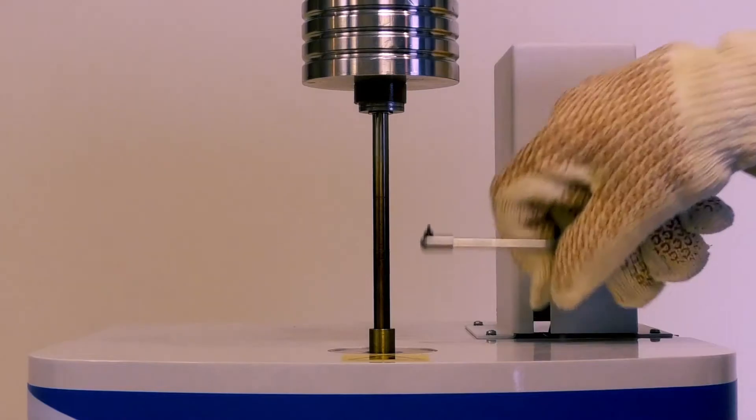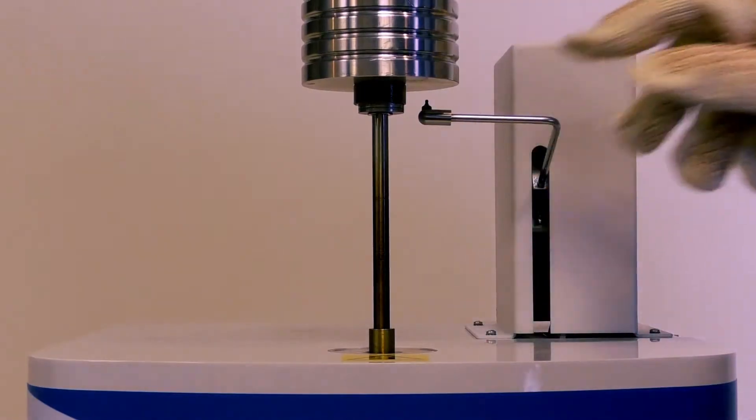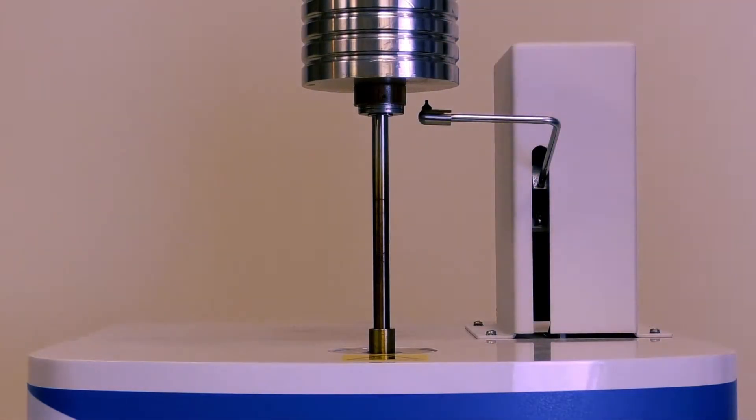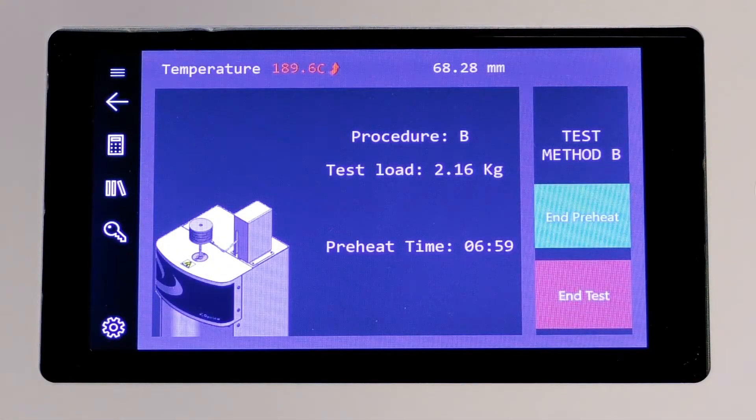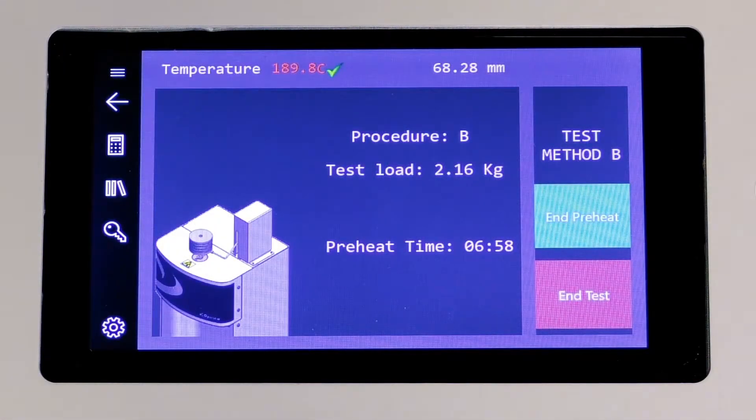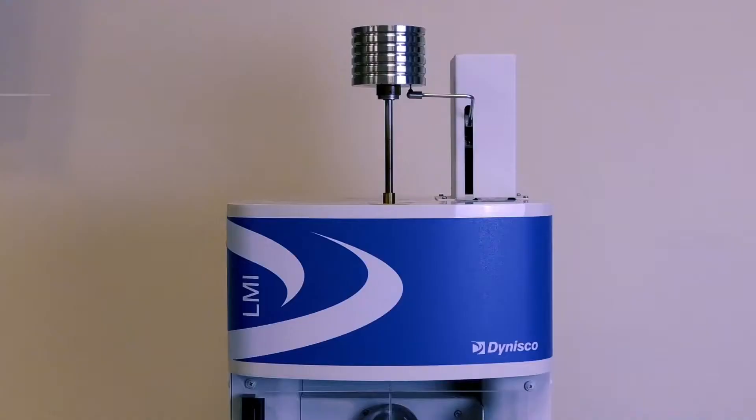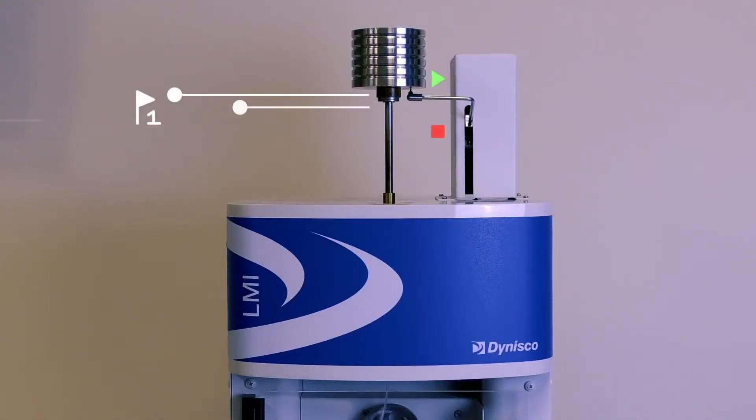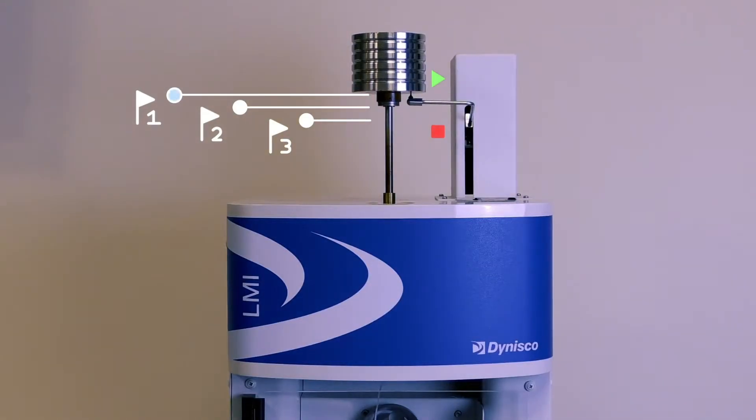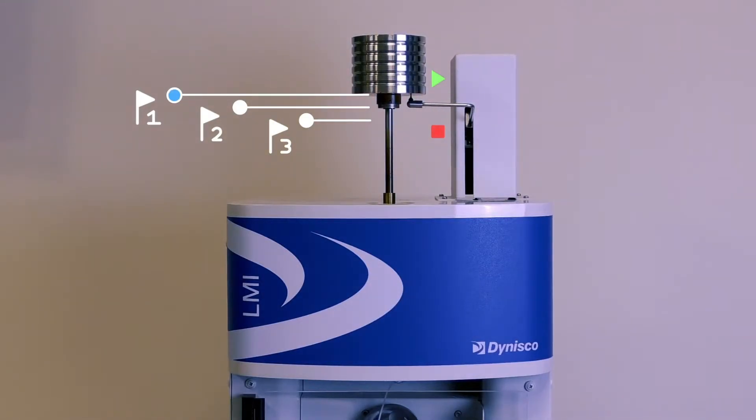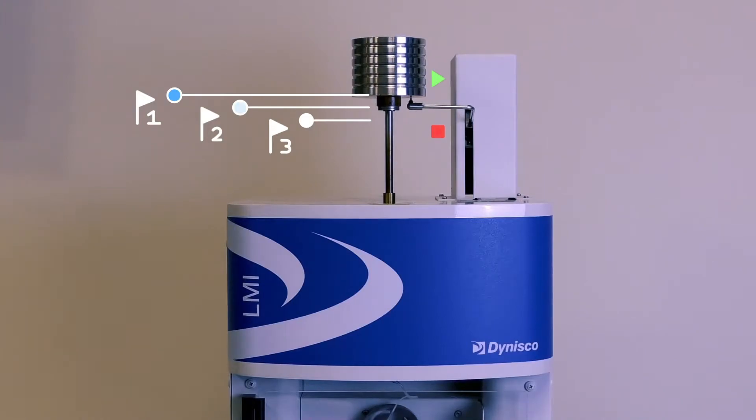The operator will advance to the next step of raising the encoder arm. Melt time will begin to count down. The operator now must wait for the polymer to melt. As the melt time elapses, the piston will descend and the weight will contact the encoder arm, causing it to descend as well.